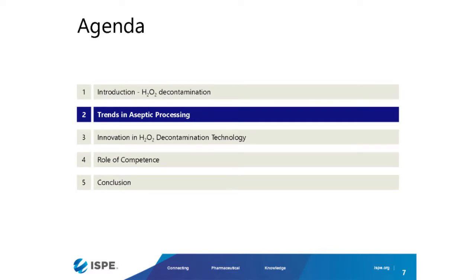Despite these three basic limitations, it's still the method of choice for most of the isolators that are being produced as a surface decontamination technique. So I would go through the second part, which is what kind of trends we see recently.